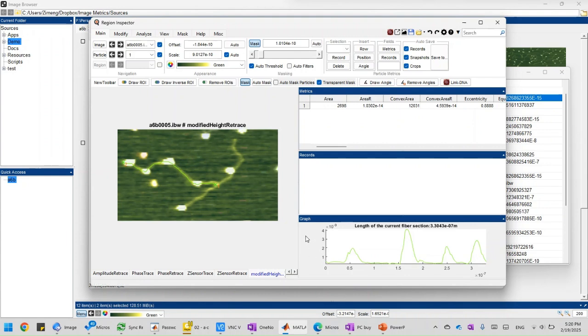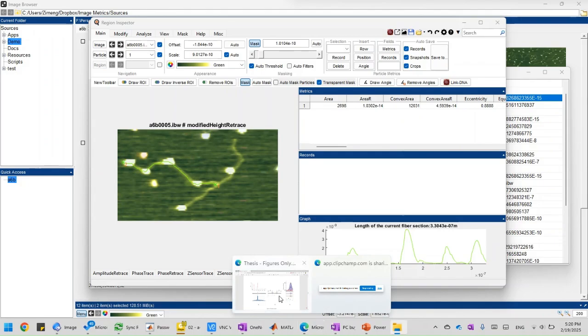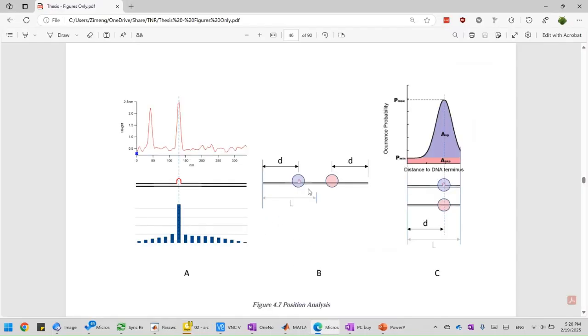So, why is that important? Let's go back to our figures. So here I have this protein, right? Because the protein has a size, if it's small, then it does not matter to our precision. So if it binds to this structure there, DNA slips out right there. So if the protein is small, then the peak would correspond to where the slip out is, right?